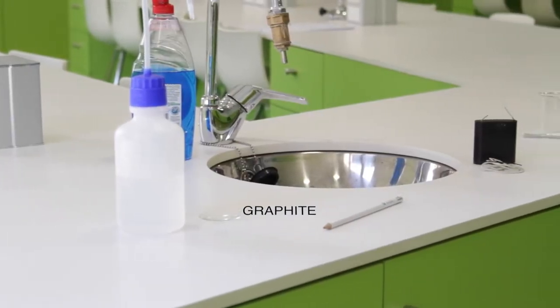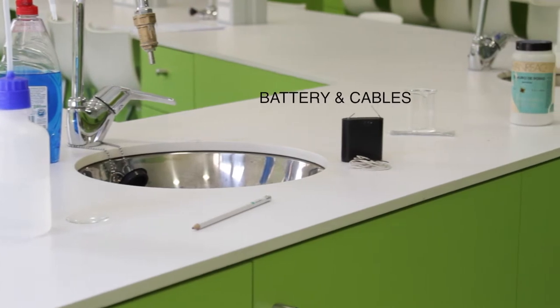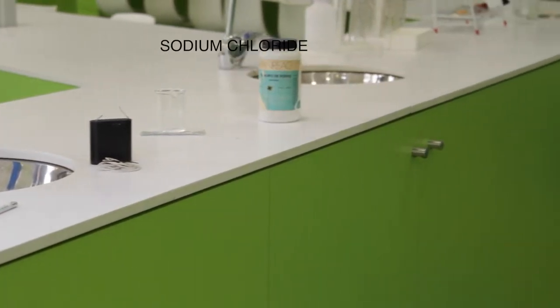Water, graphite, a battery and cables, a beaker, copper bar, and sodium chloride.